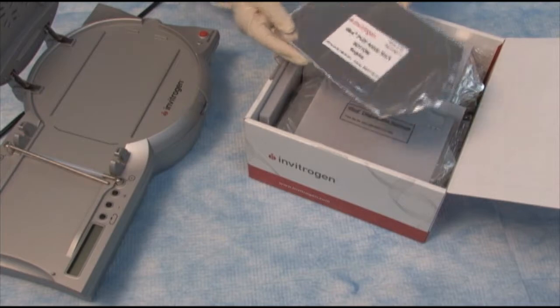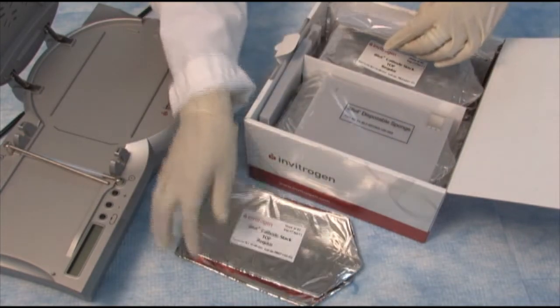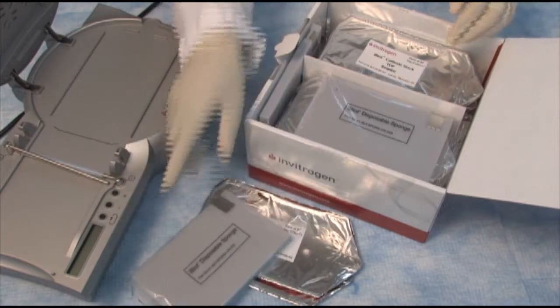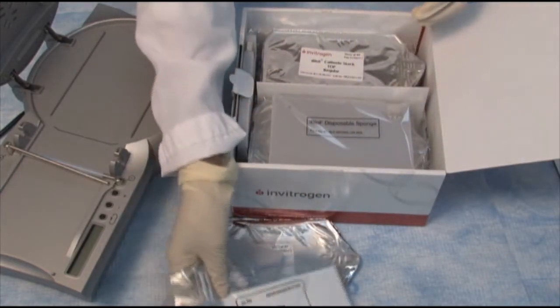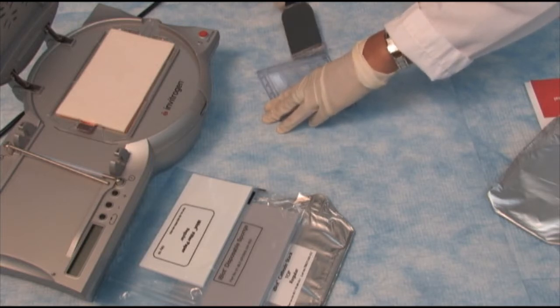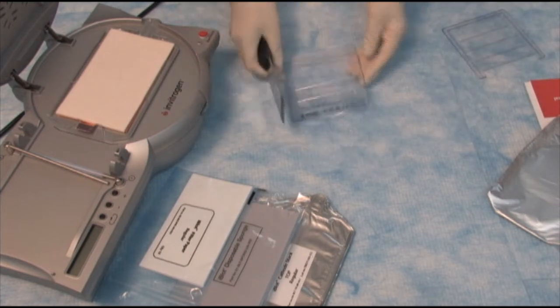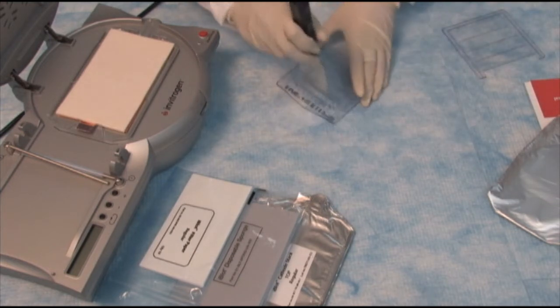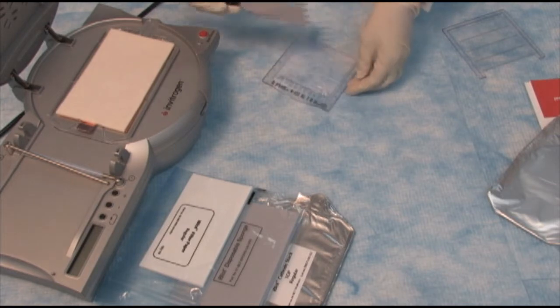Inside the box you have a bottom stack, a top stack, a sponge, and a pack of filter papers. We're going to get the gel by breaking open the cassette. I cut the welds off and the bottom edge of the gel.